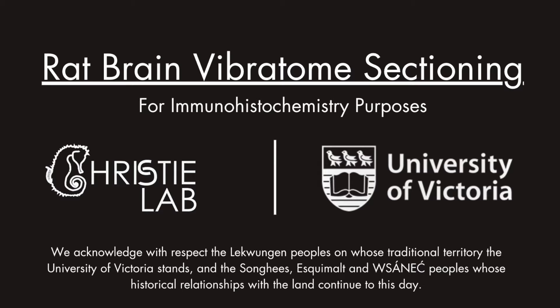In this video, we will go over the process of how to section a rat brain using a vibratome.